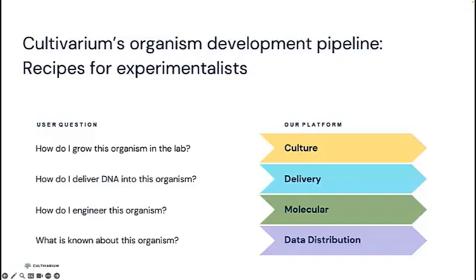And to answer these fundamental questions, Cultivarium's organism development pipeline is divided in 4 different platforms to tackle each question separately: the culture, delivery, molecular, and data distribution platforms. Now I'm going to show you how we present the answers to these questions to users through our portal.